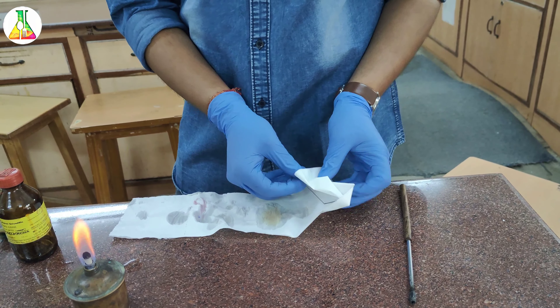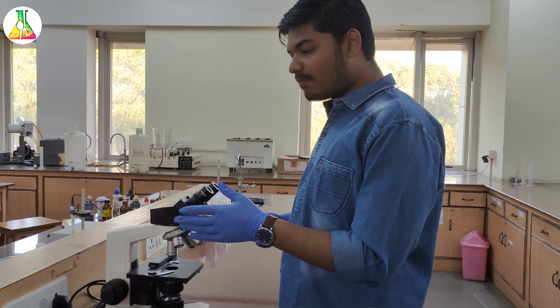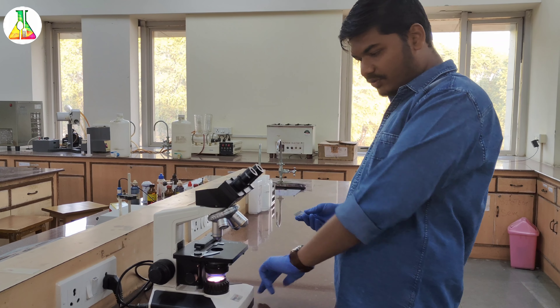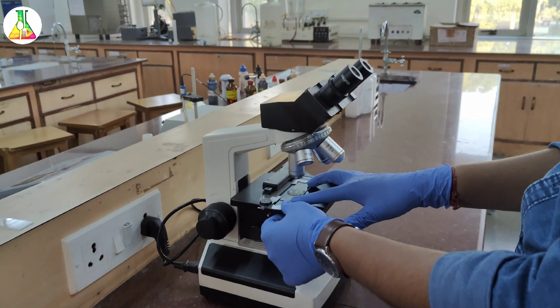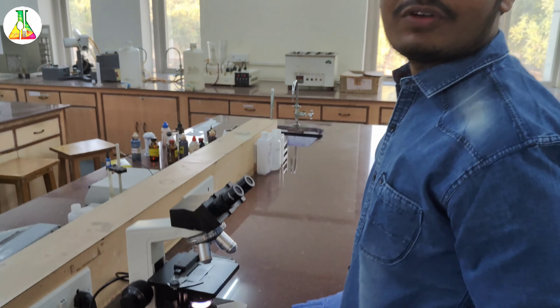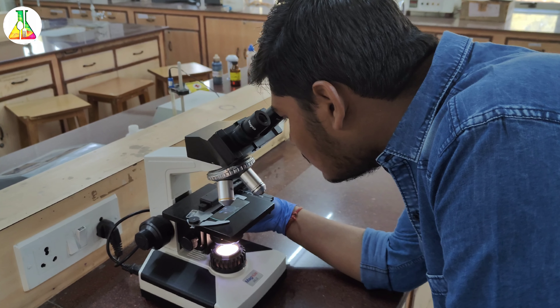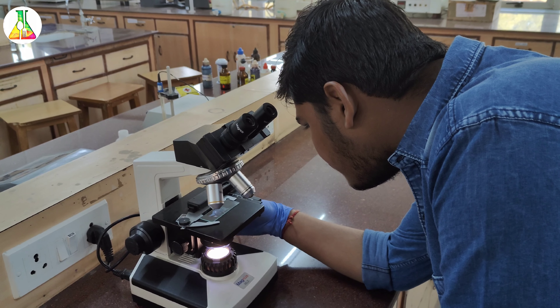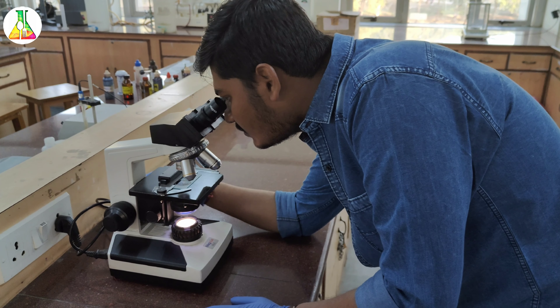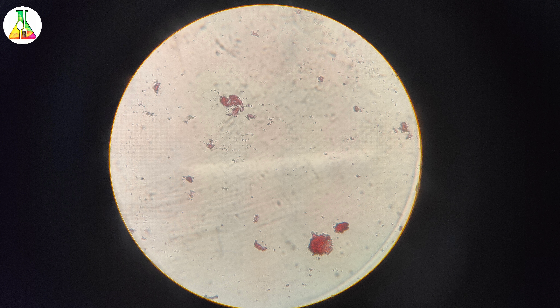First of all we will light up the lamp. We spread a clean filter paper and on to it we put our clean slide. We sterilize the bacterial loop until it is red hot. We will take our sample which happens to be this buttermilk, and we will gently pick up the sample. Now, holding the slide edges between our fingers, we will prepare the bacterial smear using a circular motion.